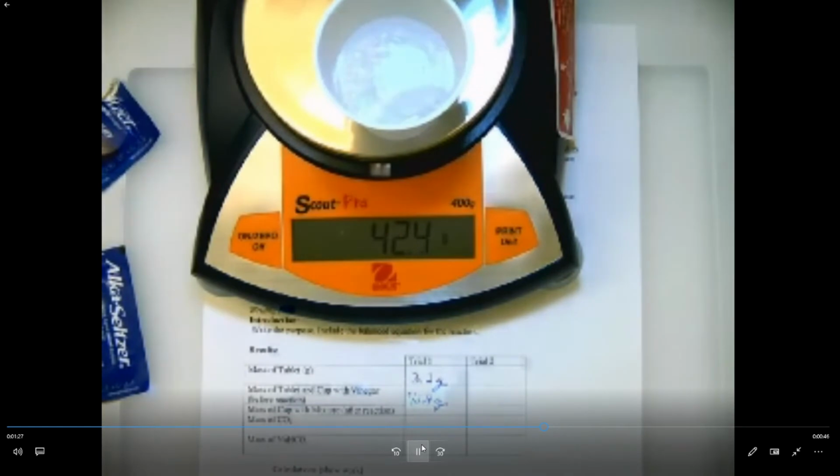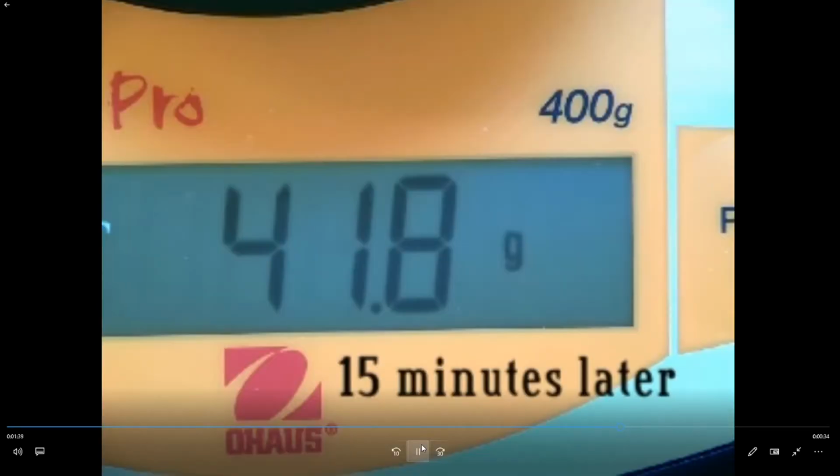Okay, now we put the Alka Seltzer in the vinegar and we let it completely react. Wait till all the bubbles are gone and then record the mass again.